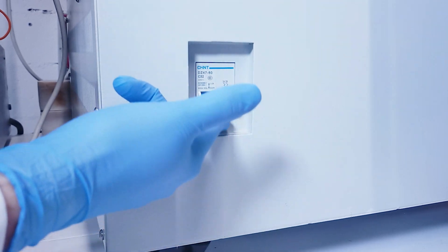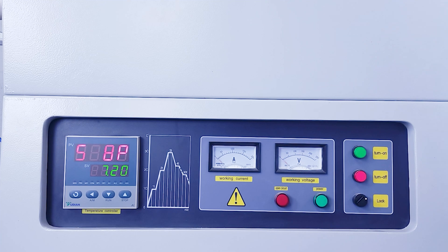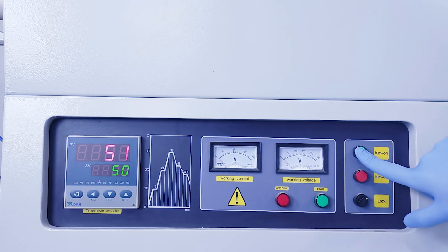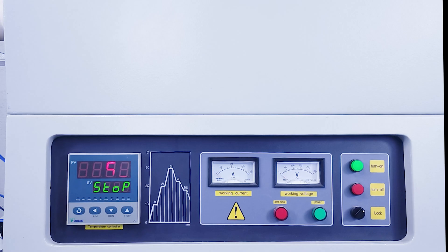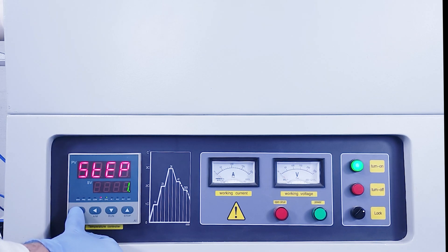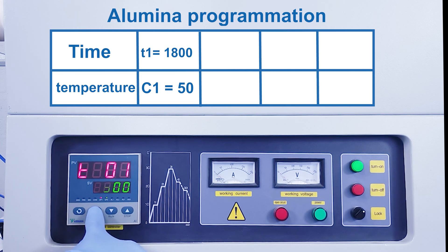Now let's see how to program the furnace. To switch on the furnace, reset the breaker on the side, then turn the black button and press the green button. A run consists of several steps and you need to enter a temperature and time for each step. Press the circular arrow button twice and then the left arrow to start programming the furnace. The first temperature is then displayed — it is the starting point of the cycle, which is always 50.